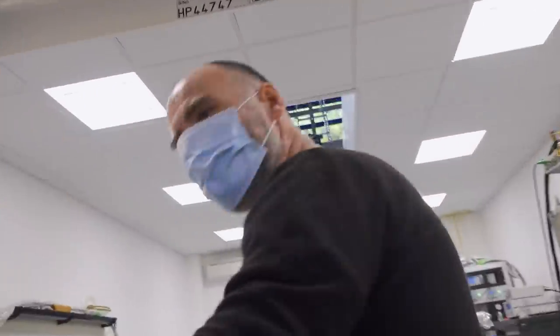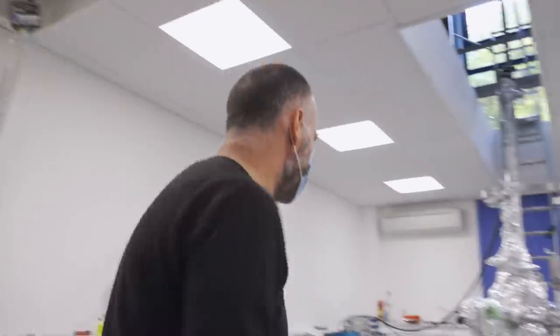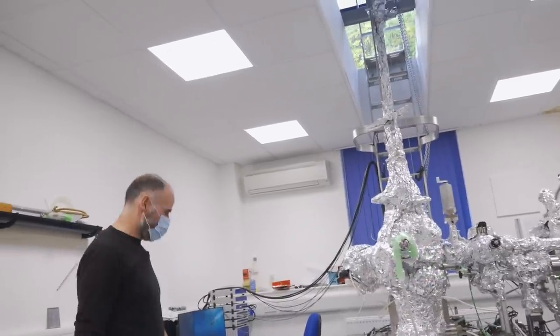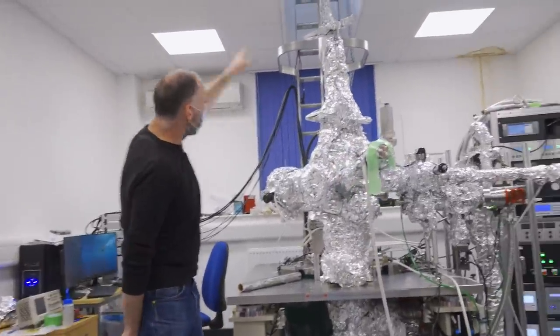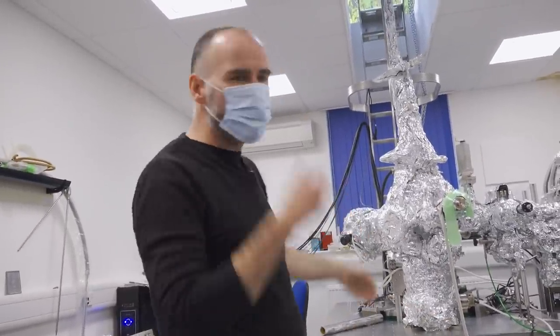Okay, so you can feel it's really hot in here. Oh, wow. And the reason it's really hot in here is because, well, things have changed a lot, haven't they, since the last time you were here. Tables in place, magnets down there, this long transfer tube's in place. The whole thing is covered with tin foil because we're heating it up.